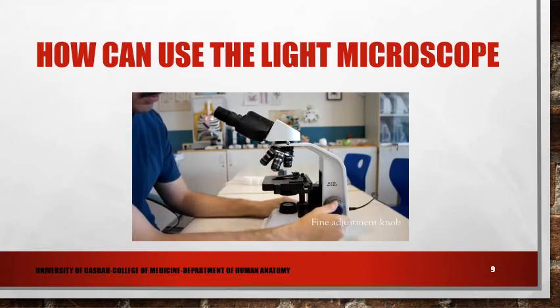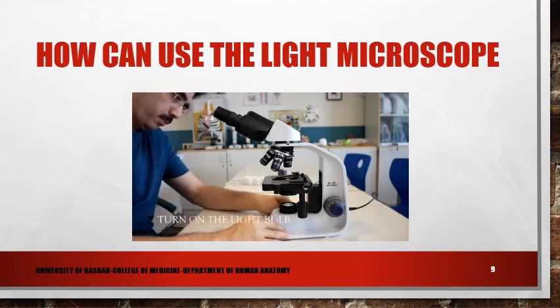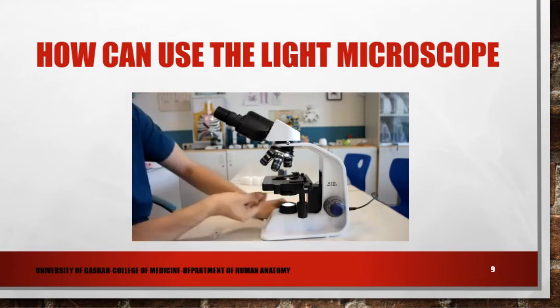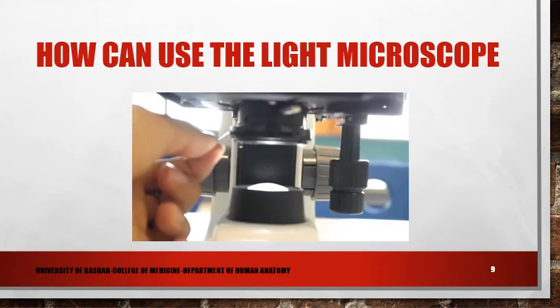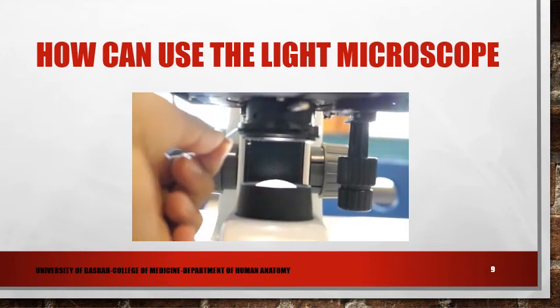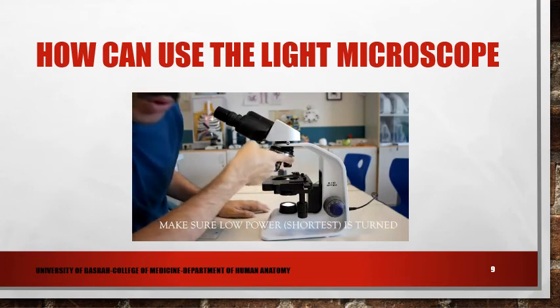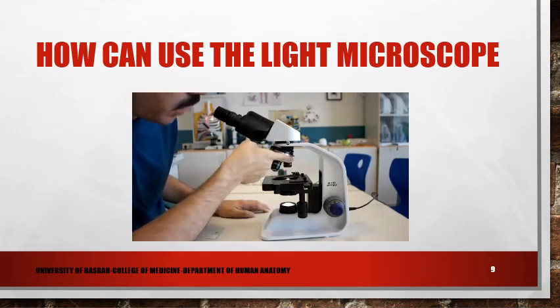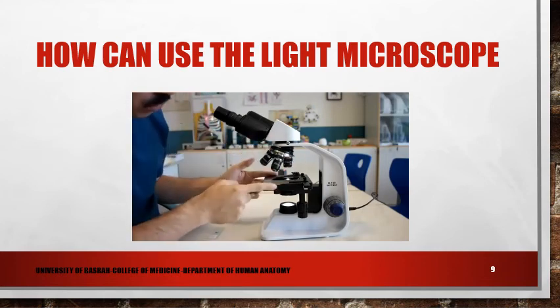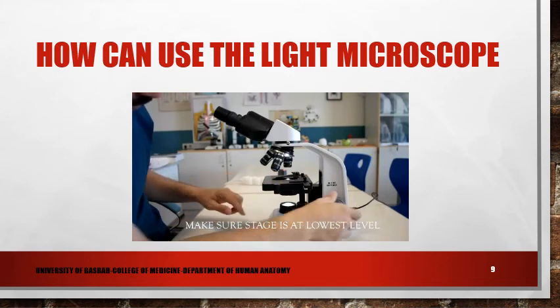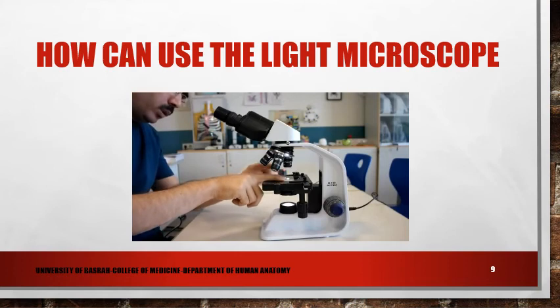Turn on the microscope and see the light coming up. You can adjust the light with the diaphragm if necessary. First make sure the shortest one, the low-power objective lens at 4x, is turned on. Make sure the stage is down, then fix the slide onto the stage with the stage clips.